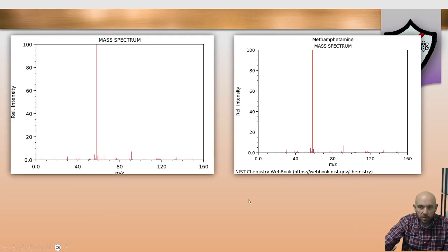We really saw pretty close similarities to that methamphetamine spectrum, and if we line the two up beside each other, we do see that it would match, and we could say, hey, looks like our unknown compound, the result of the death, was an overdose on methamphetamine. And indeed, the molecular weight of that molecule is 149. So we could use that as evidence that this is our unknown molecule.